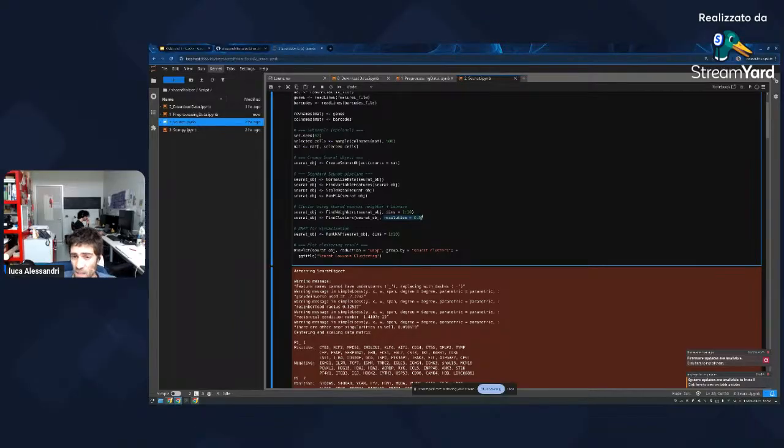Of course, resolution 0.5 is a good value. It was actually evaluated empirically. You might want to change it in order to have a more global vision or a more local vision of the data. As before, you have to just play with the data and see what's going on.